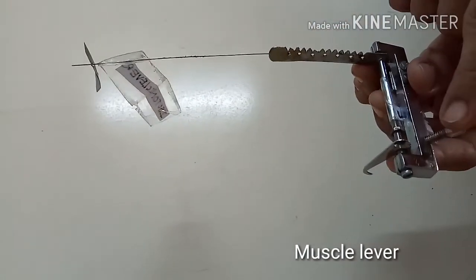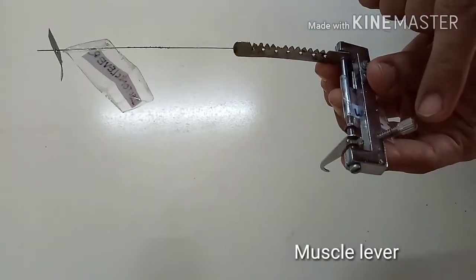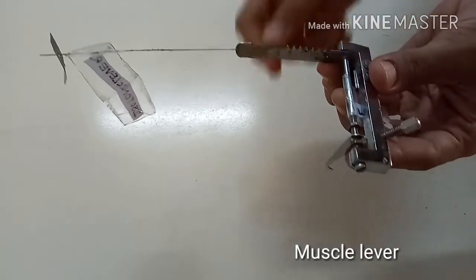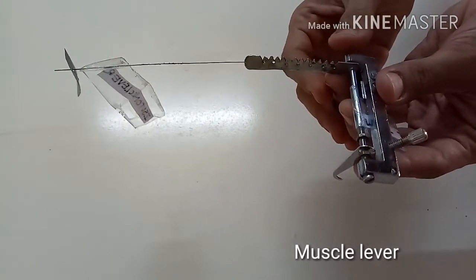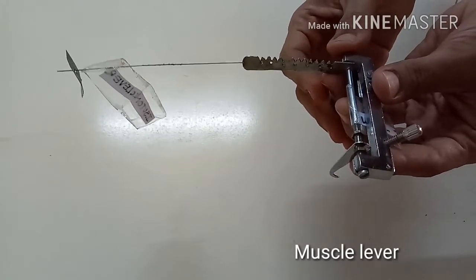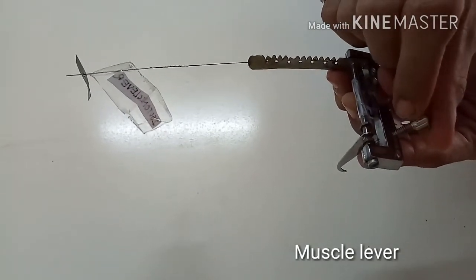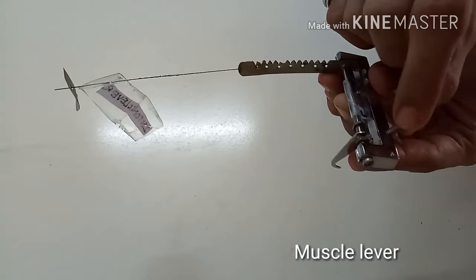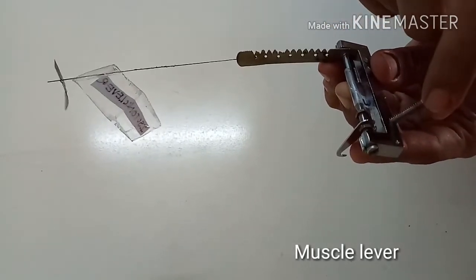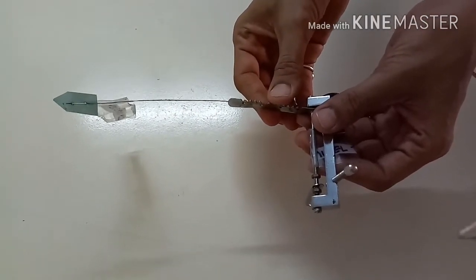It has one afterload screw. This afterload screw is present near the fulcrum of the lever, which can limit the downward movement of the fulcrum to the desired level. The afterload screw fitting in the frame supports the vertical arm, or it can be withdrawn away from it in free loading condition. Muscle Levers can be mounted on the wall of Lucas Moist Chamber.